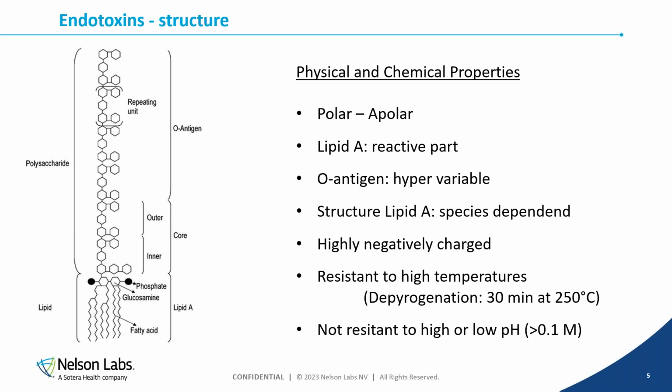We injected the filter, the IV bags, and we didn't find anything back, just because they were sticking on the surface of the polymer bags. They are very resistant to high temperatures, and that's also a very important feature, because if you sterilize your product by either ETO or using steam, they will not be destroyed. Steam sterilization or ETO will destroy the bacteria, but you will get a release of endotoxins, because the cell wall is completely destroyed, but the endotoxins are left untouched.